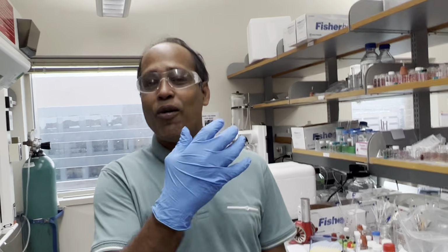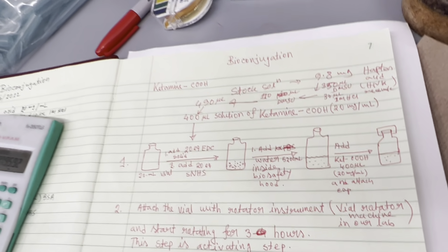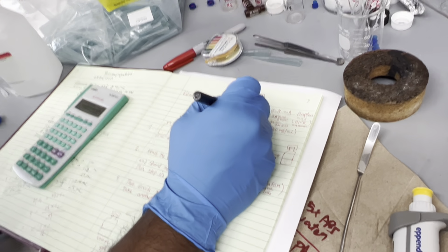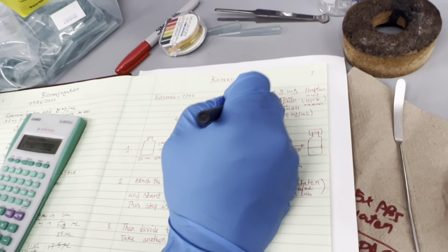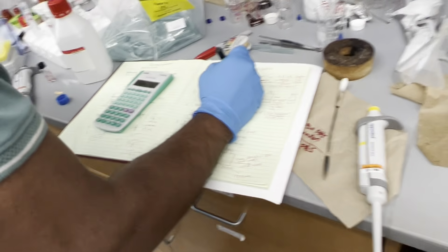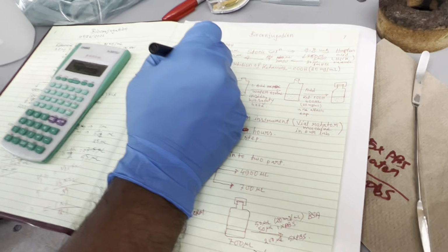So you have to calculate, for 400, how much? We have the ratio. So you calculated it will be 24.48 microliter of the water. So in that case, when we are using this 5200 microliter of the water, we will use less water there. You got it? So here, I will use 30 more microliter. That means 140 microliter. So if you make one mistake, all your numbers are off. So 145 microliter. So the total volume will be this plus 30 microliter.